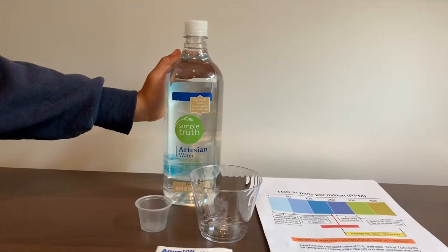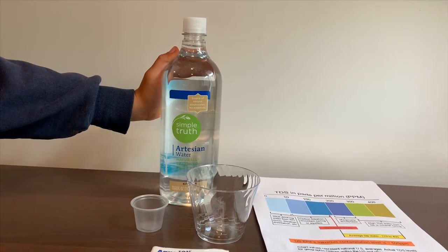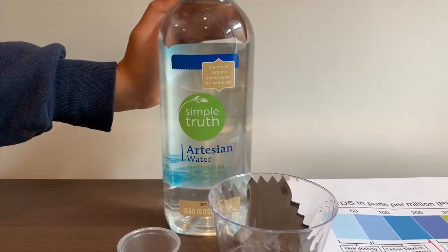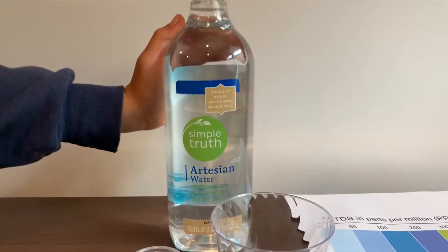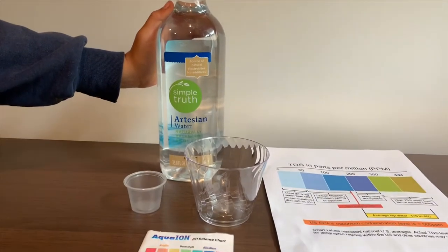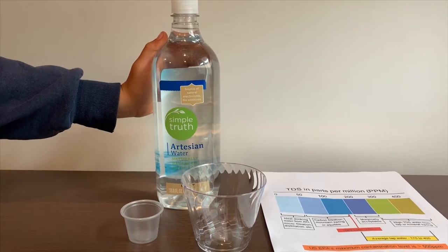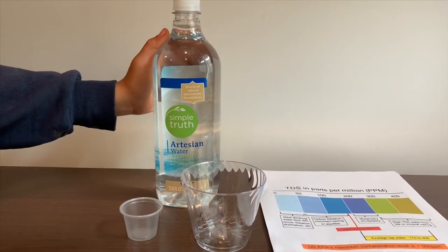This is Simple Truth Artesian Water. It should have a natural balanced pH of 7.6, and it costs $1.19. We tested the purified version of this — its TDS was 22 and its pH was 5.5. Let's see how this compares.